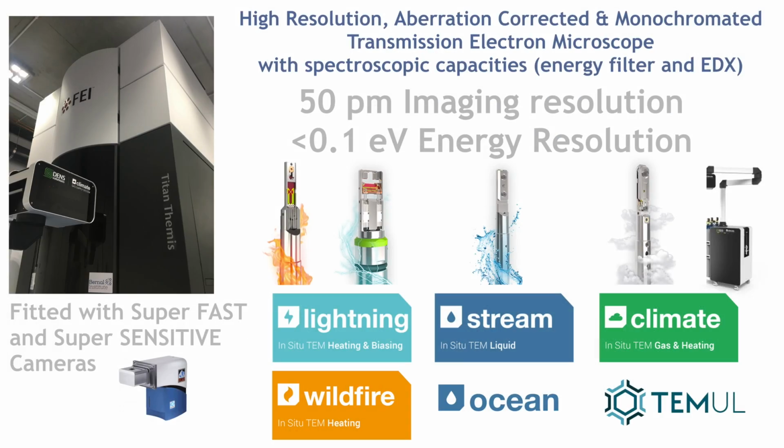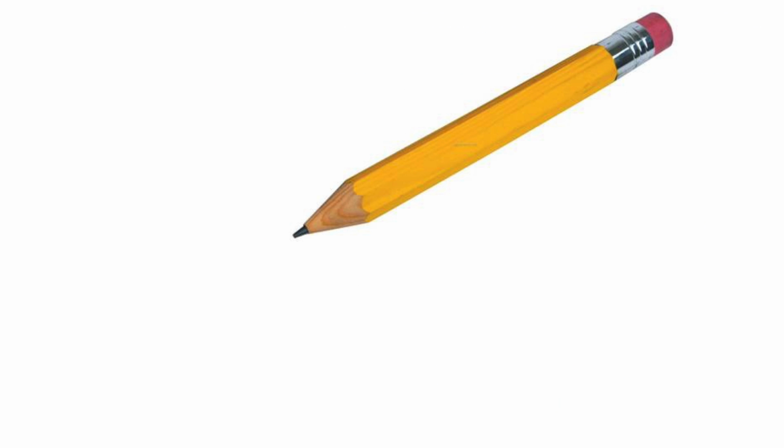I'm Ursel Bangert, a physicist and Bernal Chair in Imaging and Microscopy at the University of Limerick in the Bernal Institute. I would like to introduce the impressive electron microscopy facilities which we have in the University of Limerick. With transmission electron microscopes, TEMs for short, one can image materials down to the atomic level and reveal the arrangements of atoms. Here you can see, for example, what it looks like when we focus into a pencil tip.